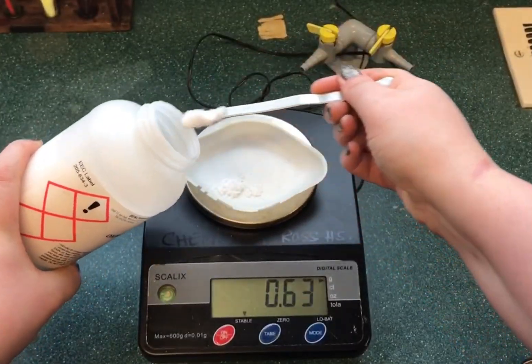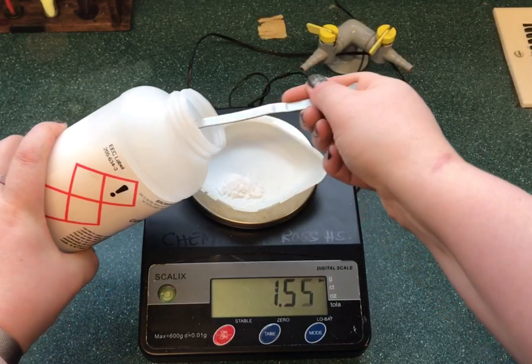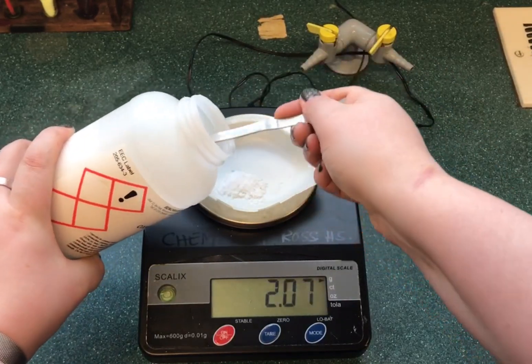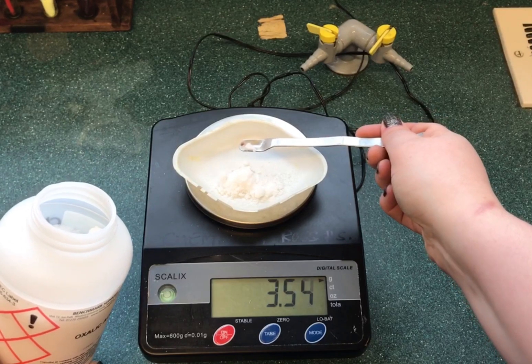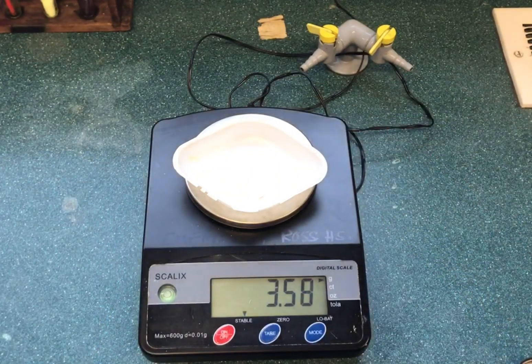You can then put into the weighing boat your solid that you're wanting to weigh out and you'll be able to see the mass that you're weighing. This is useful if you don't need to know the mass of the beaker or the weighing boat.